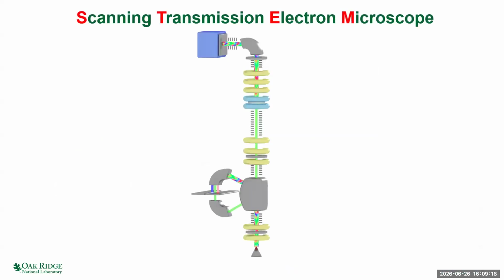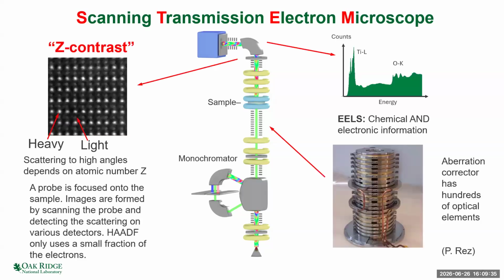Okay, so I'm going to be talking about mostly scanning transmission electron microscopy. So if it was longer, I think I'd go through this in a bit more detail, but you can see a STEM which I've drawn the right way up this time, with the source at the bottom and the detectors at the top. Really, the important thing is that the exciting electron optics are mostly before the sample, and we form a very small probe which is about the size of an atom.